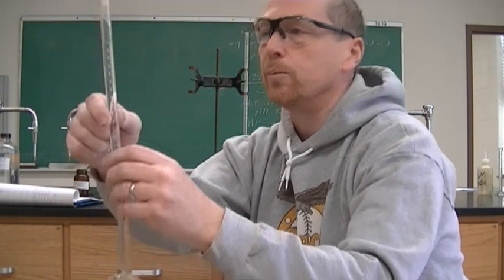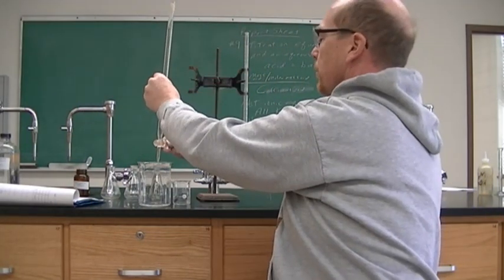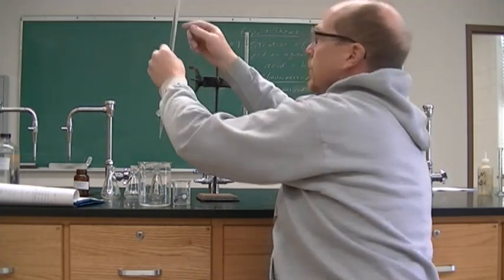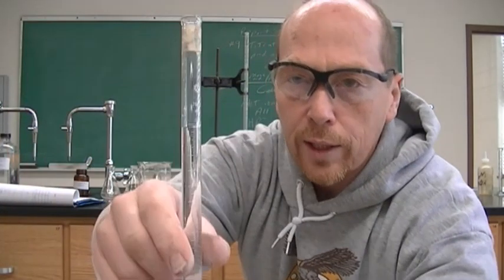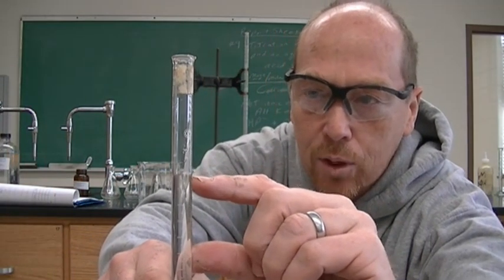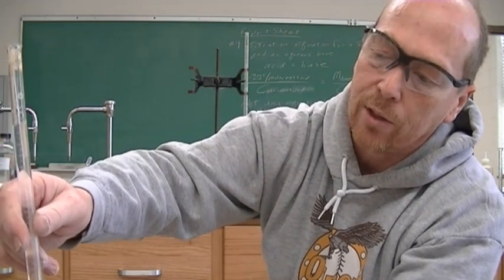0. Now a burette, you read a burette to 2 decimal places. And so I'm going to bring this down a little bit. I don't want it to be at 0. I want to read it. All right, and so when you read it, it is at 0 here, and so it is slightly below the 0. And so it's a very strange scale. It goes from 25 up to 0.